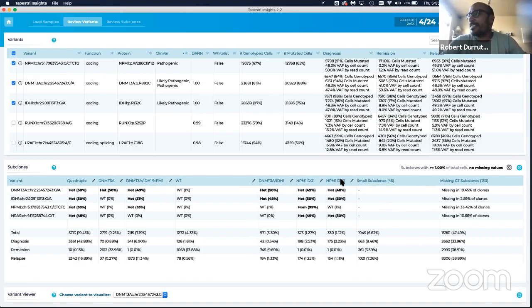The reason I call it DO2 is that if you suspect allele dropout, by definition, it's a random event. So if you fail in a certain fraction to amplify the reference allele, you should also expect that you fail to amplify the other allele that carries the mutation. As a result, you would get that clone where you only have the reference reads available.